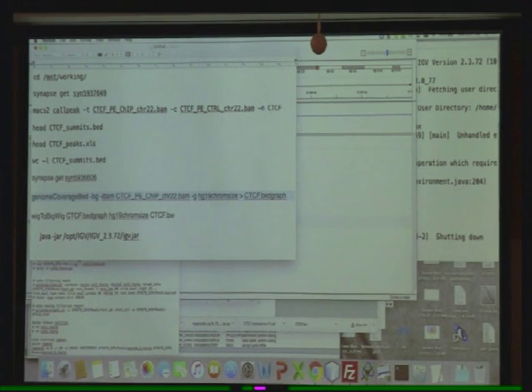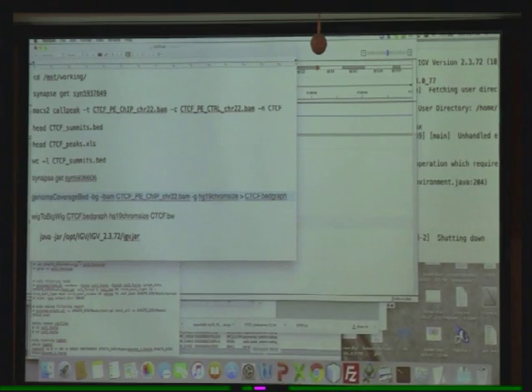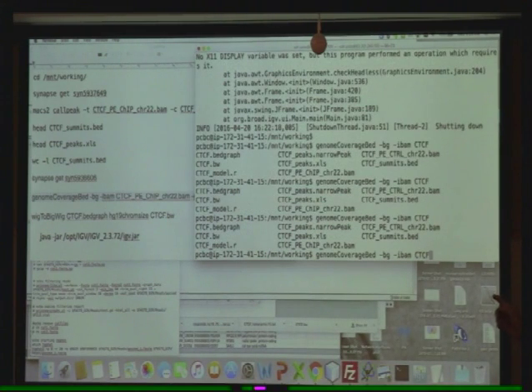People might not actually know what tab complete is, so you can use demo it. Okay, but you're in the right place now. So if I wanted to do this one function, genome coverage bed, okay? And then I look at dash BG, dash IBAM, space, and then CTC. If nothing comes up, then you know it's not there. So then I could hit tab a few times, and it'll tell you what your options are.